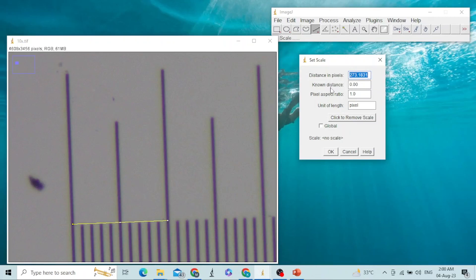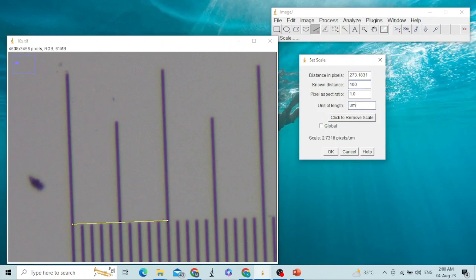The second option is known distance. The known distance between two large divisions is 100 micrometers. We will write 100 and set the unit of length as micrometers (um). Then we will check the global checkbox.